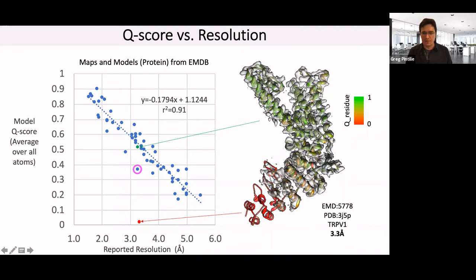And we can see that some parts are not resolved at all, whereas some parts are resolved. This is not too uncommon. A lot of maps tend to have some variability in some regions in which residues might not be as well resolved as in others. And a lot of the times the resolution estimate can use some masking.